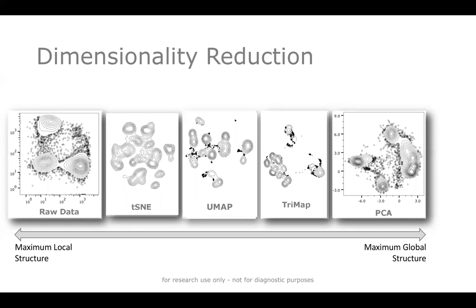Next up is UMAP, becoming more and more popular. At some point, we think probably more people will be doing UMAP than are currently using T-SNE, because it does a better job of retaining the global structure of the data set, meaning populations that are closer together in Euclidean space tend to be more closely related, whereas in T-SNE, that's not going to be guaranteed.